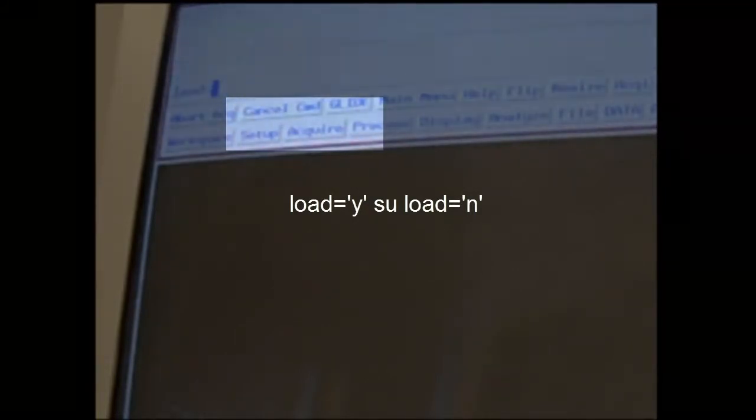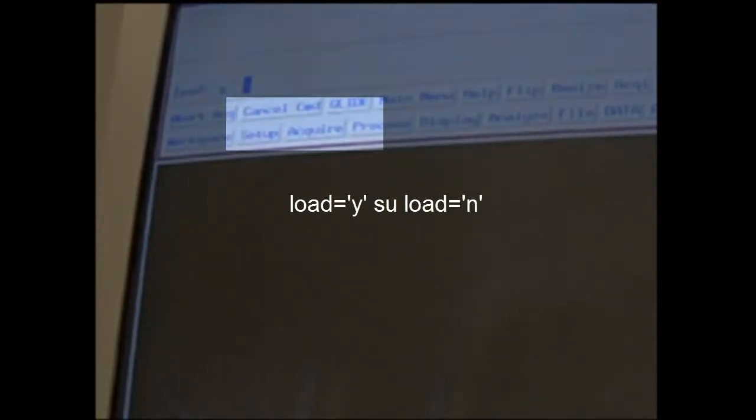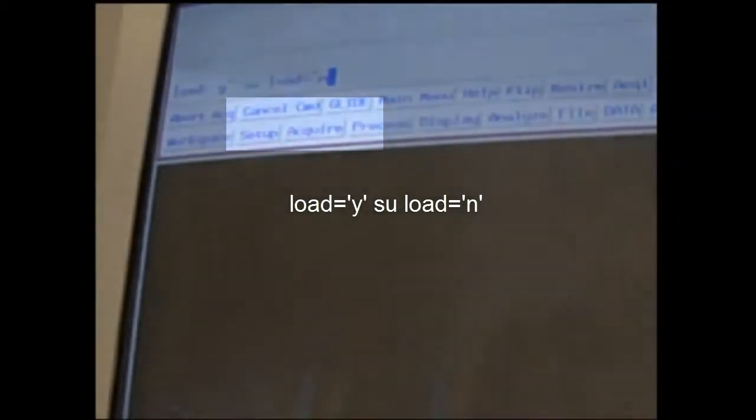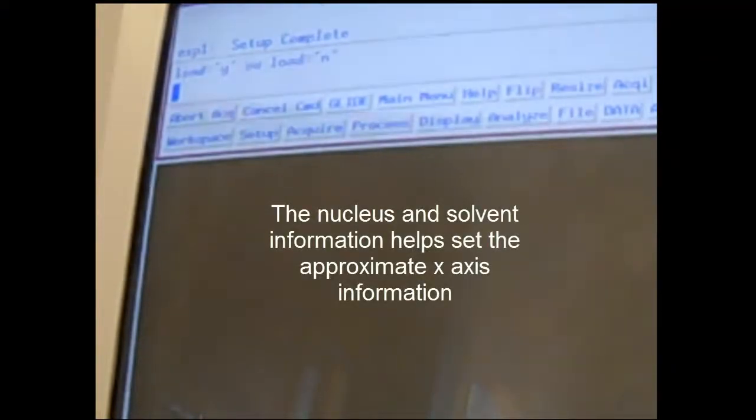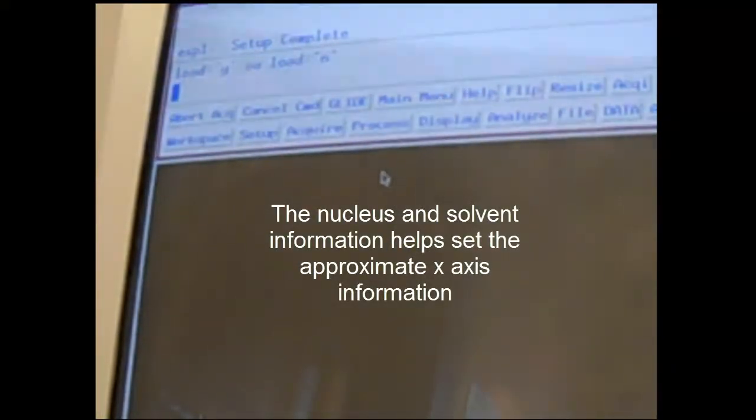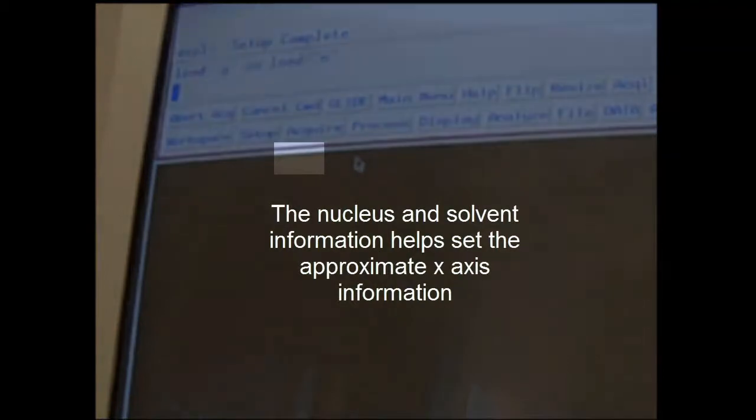The first thing you'll do is type in load equals Y, SU load equals no. What that's basically saying is it's going to load the shim file, and then anything that you do to make adjustments to the shim file are going to be deleted. So the shim file that's set up by instrument specialists will be loaded but not overwritten by anything you do. Once you've done that, the next step is to load the appropriate nucleus that you're studying, like a proton, and then pick the solvent.